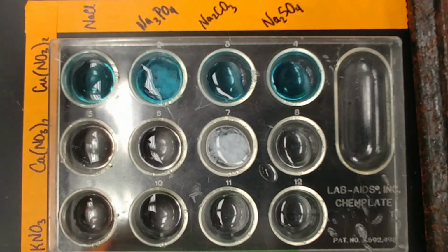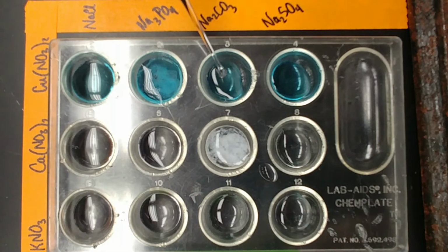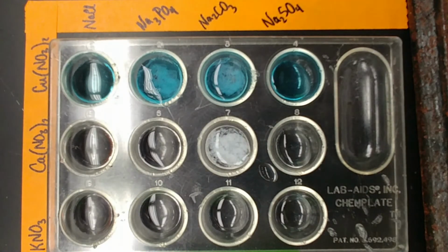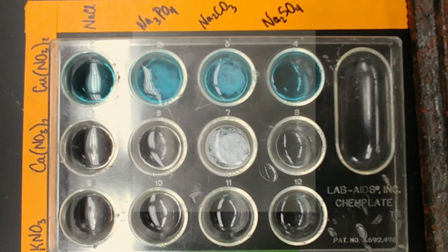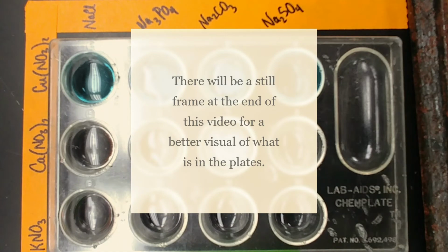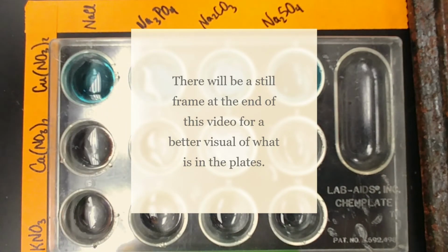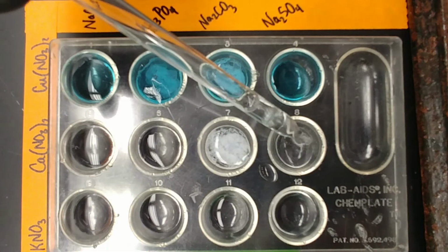Oops. Almost had some contamination there. And there we go for our final well. And then we go to our line for the sodium sulfate. So a couple of drops of this in each of this final row.